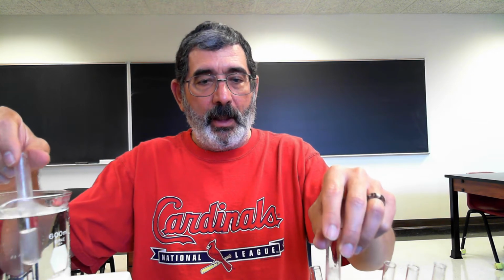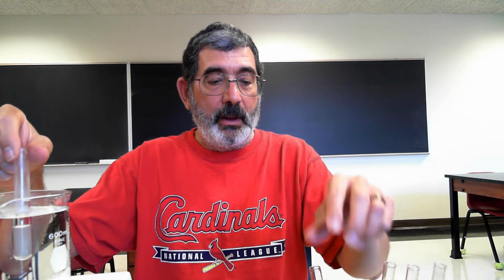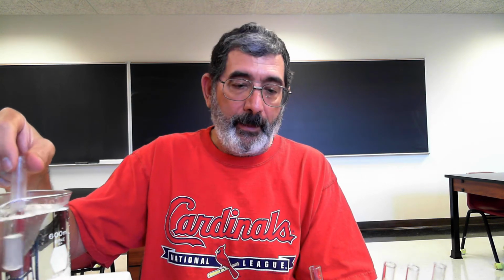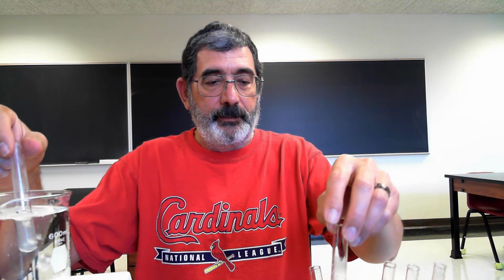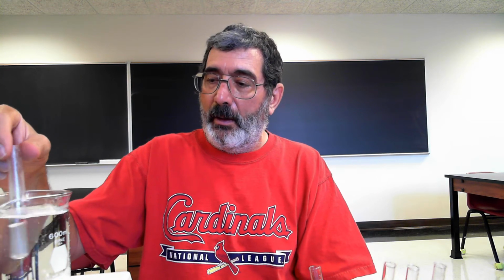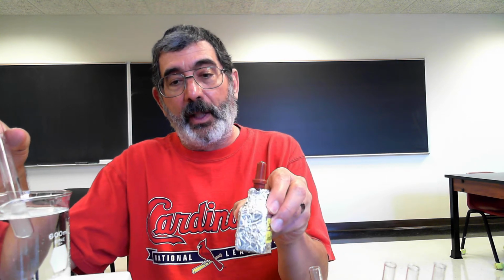Stir these a little bit, the hot water and the cold water one. Again, I want to make sure that my enzyme changes temperature before I add the substrate. So bear with me just for a minute. We might review while we're waiting. Remember that the place on an enzyme where the reactant, the substrate, attaches is called the active site. And for our enzyme to function properly, the shape of the active site has to match the shape of our substrate.